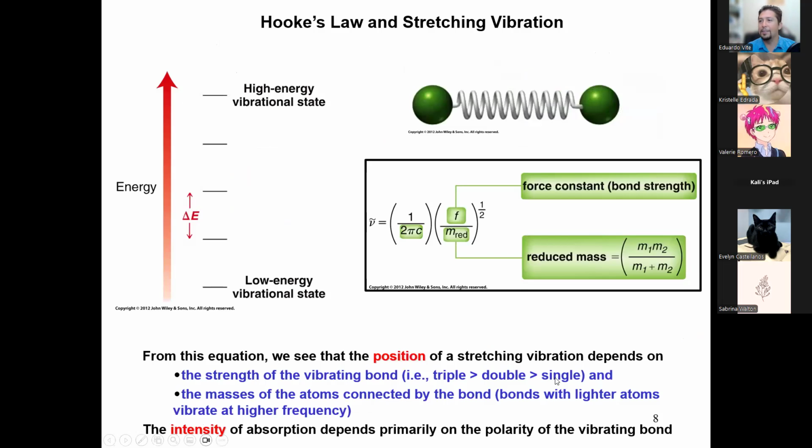Alrighty. So again, why do we talk about this so much? Because this is literally the key. A spring with two balls on the outside. Those balls are the atoms. The spring itself is the bond. This is the actual physics equation.